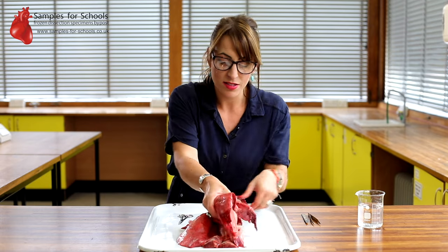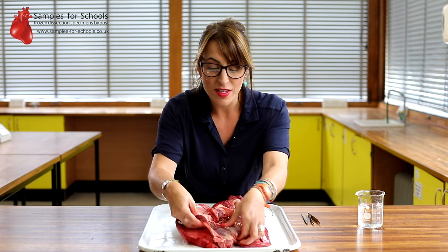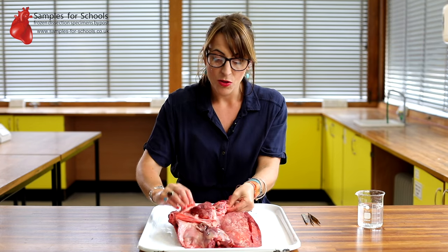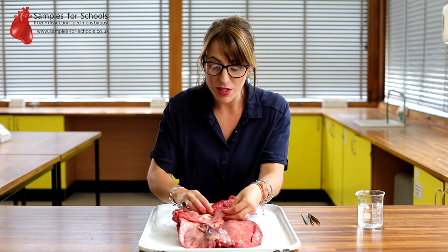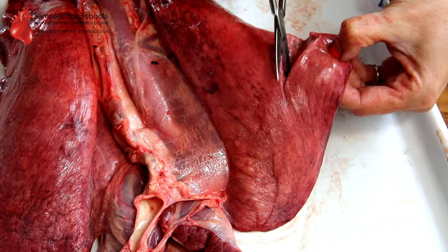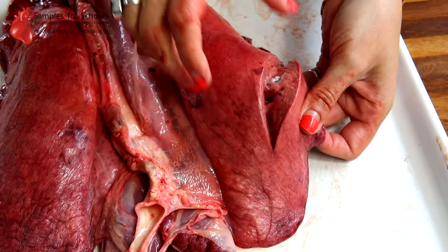If we turn the lungs the other way up, we can see where this corresponds to the rest of the intestines, the liver, and the heart. We've got some remainder of the main heart vessels, and we can see where the liver was once attached, down here. We've made some small incisions in here, so you can see the spongy nature of the lung tissue.